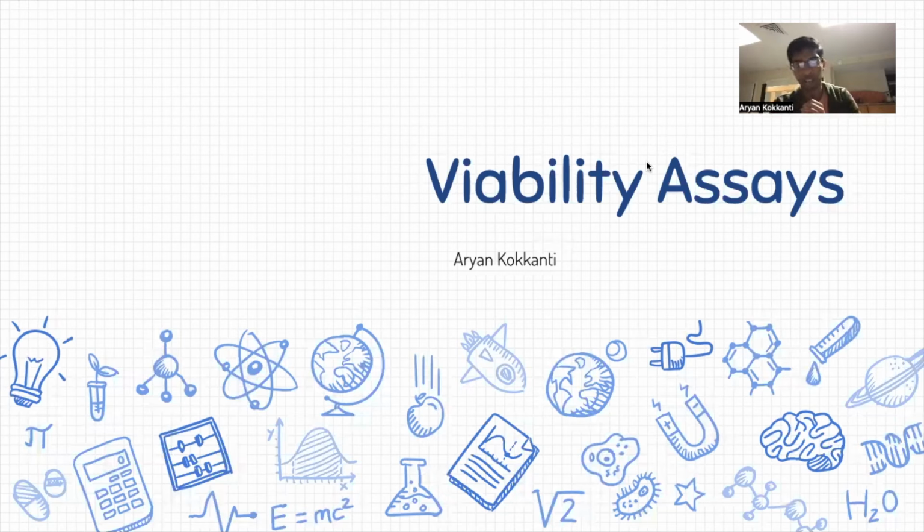Today, we'll be going over viability assays, which are a critical part of a lot of cell biology research, including those completed at the Bloom lab, such as the chromosome breakage research.